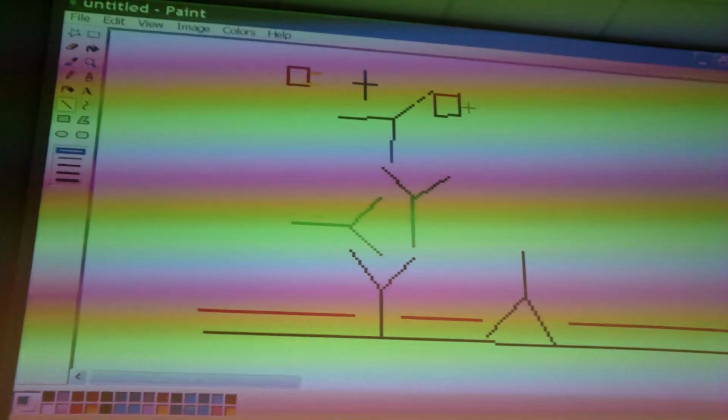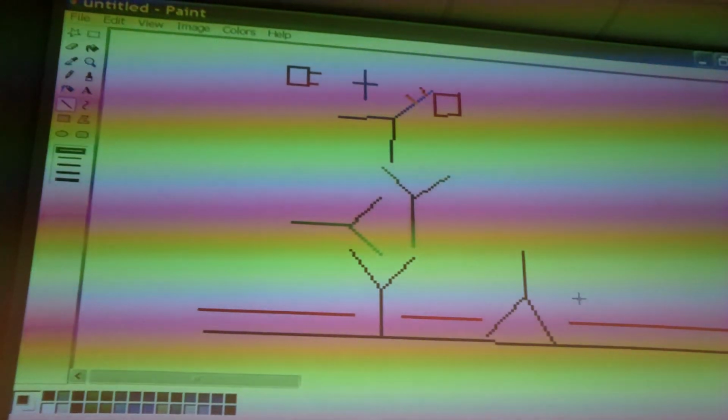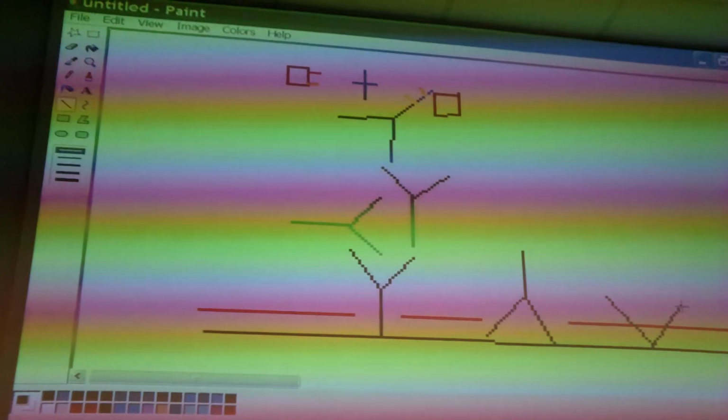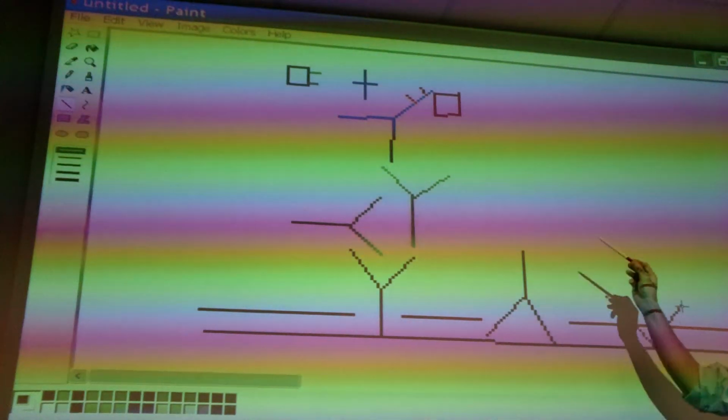Another thing to take it one step further is what you can do. You can design for the binding. So I should have left a little bit of space. For the binding, you don't need the whole antibody. So what we use very often is only the Fab fragments, the F(ab')2 fragments of antibodies. In that way, we avoid that the secondary up there recognizes the Fc part. So that's the trick. And even for the secondary, we don't need the whole antibody either. You can also work with Fab fragments there.